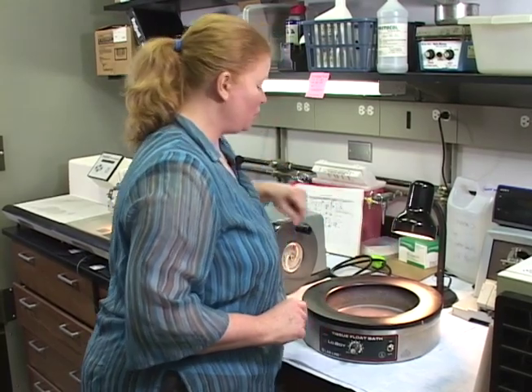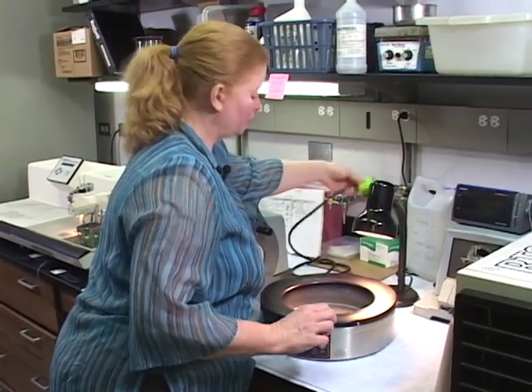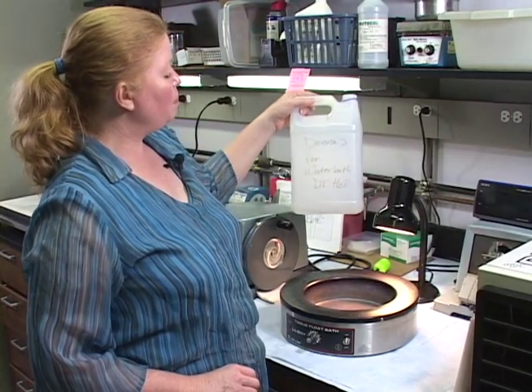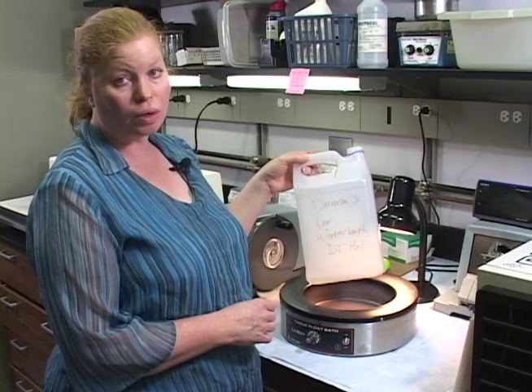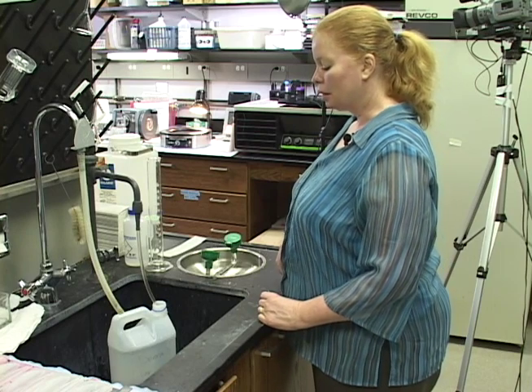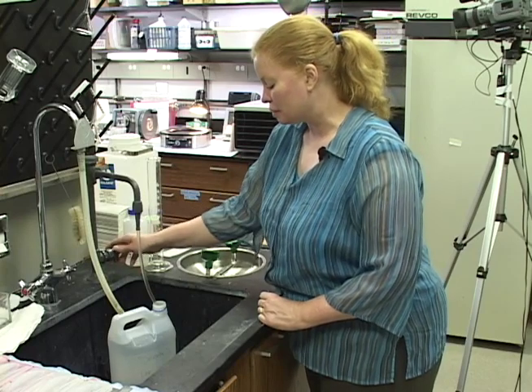Okay, I wanted to show you a little bit about preparing for microtoming. The first thing I do is I always keep the switch on, but you can turn the switch off, whatever. You just want to make sure the switch is on. I fill up the water. Fill this up with DI water or RO water. I fill this up all the way because I'm going to use some of this water when I'm microtoming. Also, I'm going to use it for the crushed ice. So you want to have just some of the extra water.